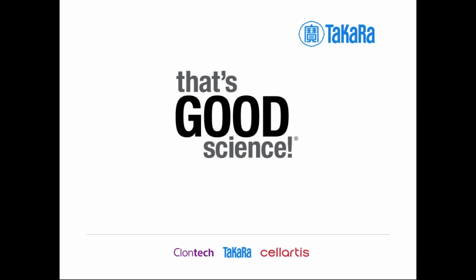We had feedback from a customer who used it with zebrafish, and at least in his hands, he was satisfied with the results, but it's difficult to recommend beyond the specifications of the kit. So at the moment, we just recommend it for mammalian.